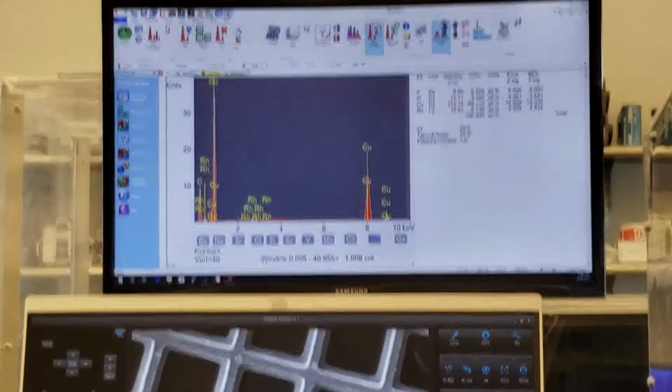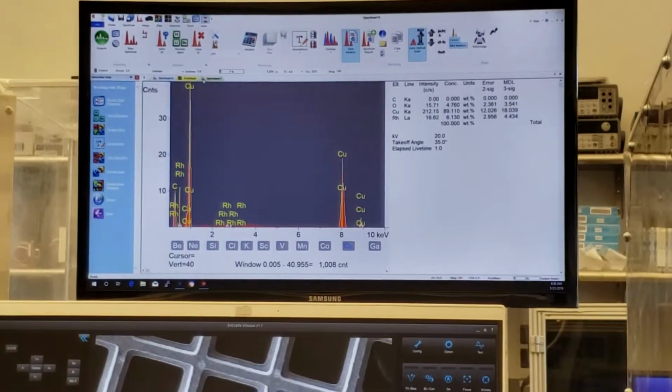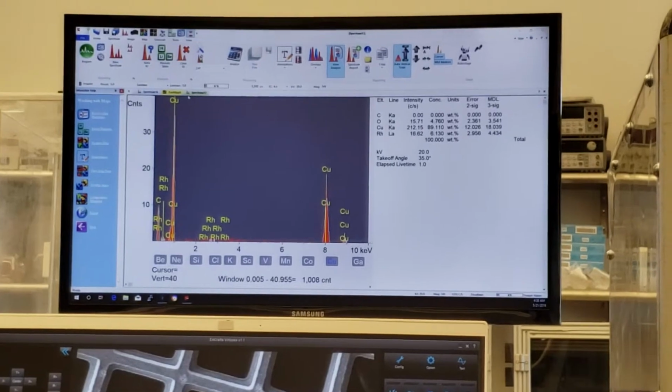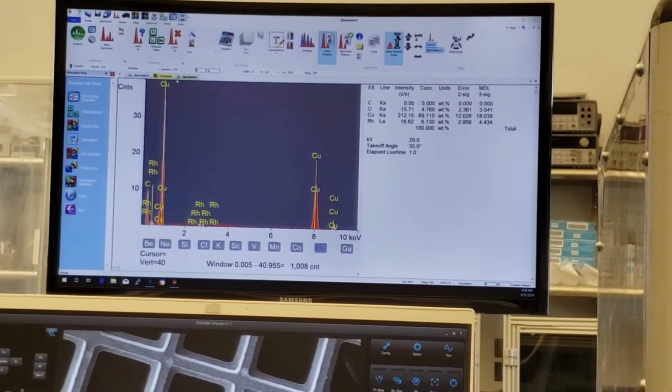Right, the JPEG is just for viewing, right? That's all it is, viewing. Strictly for viewing. That's why it's saving it as a .xxp extension in our bundle, so then you can manipulate. Exactly. Yeah, so that's why it's doing 2 saves in 1. So it's real powerful because of that.